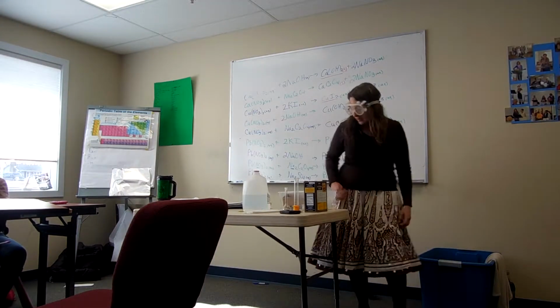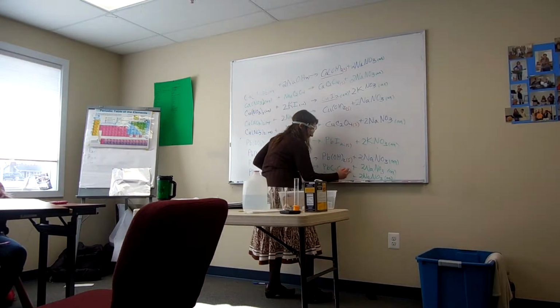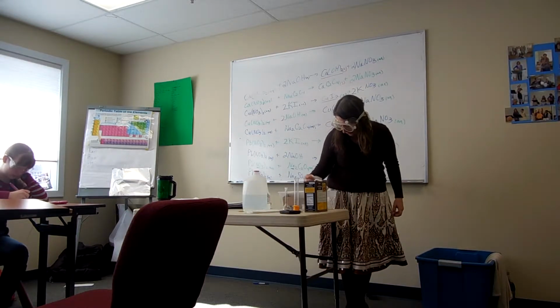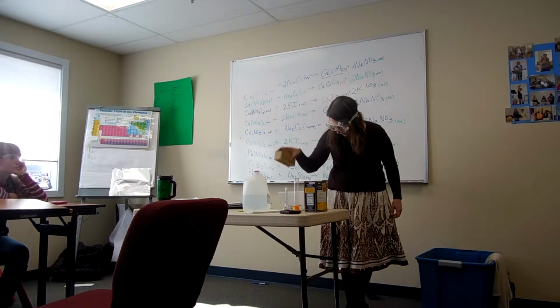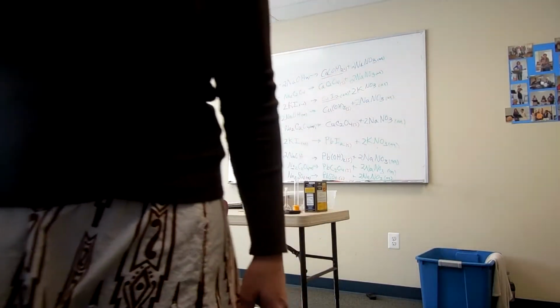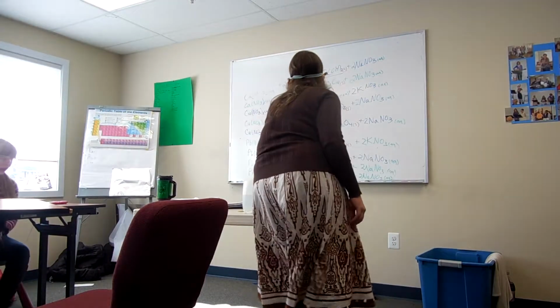Well, I think we're going to have to go with the prediction here because lead sulfate is going to precipitate, but I don't seem to have a bottle of anything sulfate here at all. If anyone happens to see a sulfate of any kind on the floor where I dropped it, we'll do it. What is that last one, though?